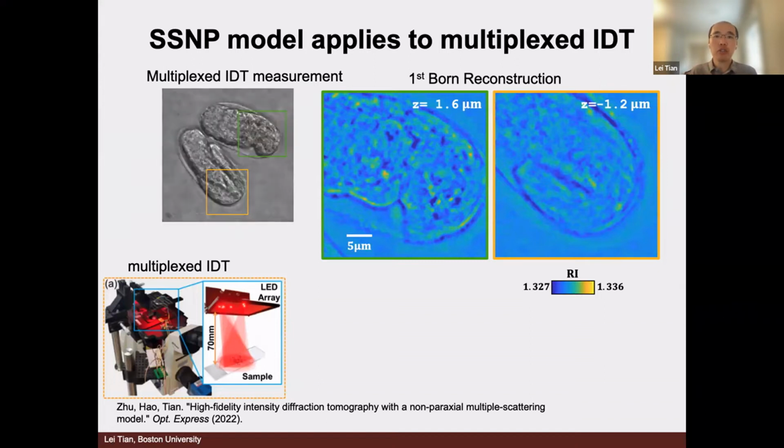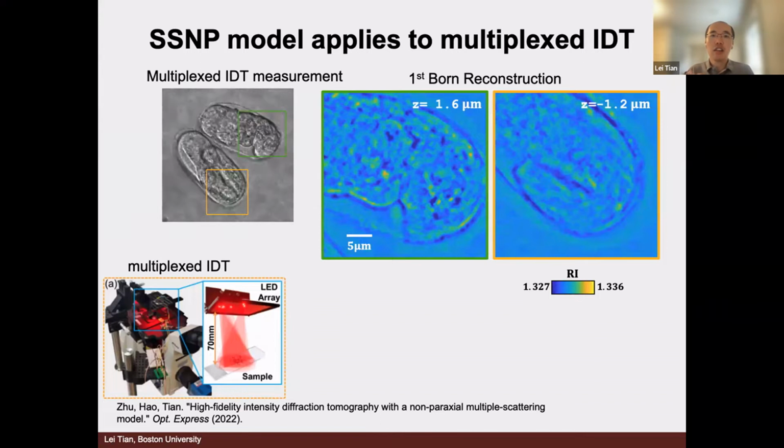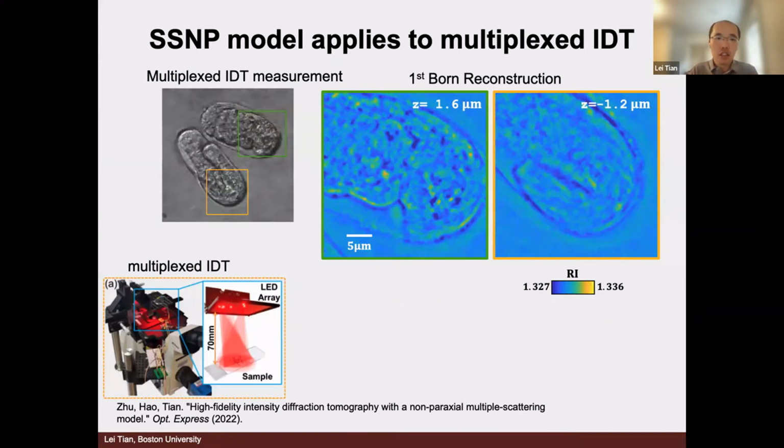And you can show that by using the method so-called auto differentiation. You can easily write one algorithm and just have an extra flag or extra bifurcation to distinguish two cases. Just to highlight this capability, same algorithm, you're welcome to play with it, go to our GitHub site. What you realize is that we can also apply this to the multiplex measurement. So this is the C. elegans embryo data set I highlighted previously.